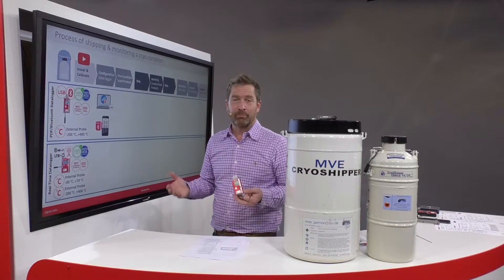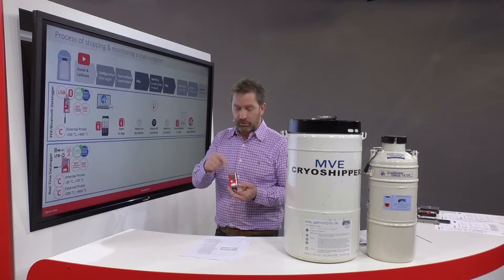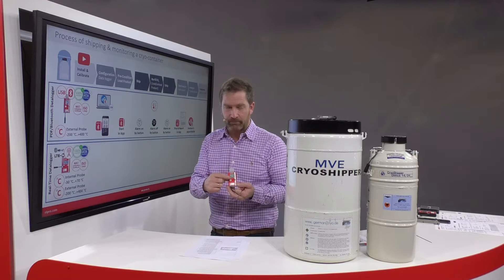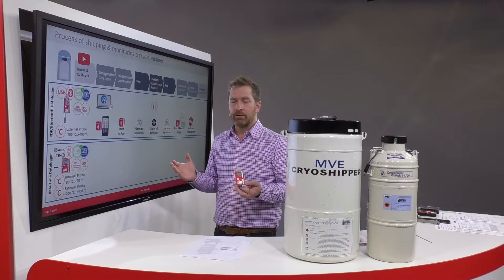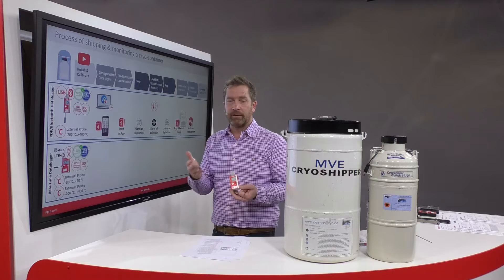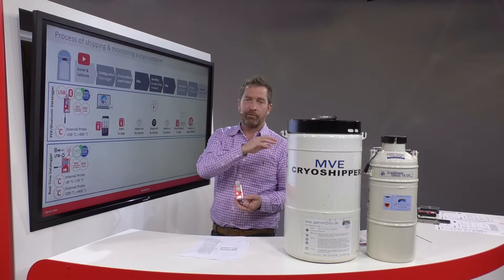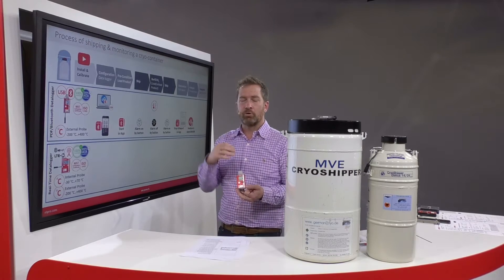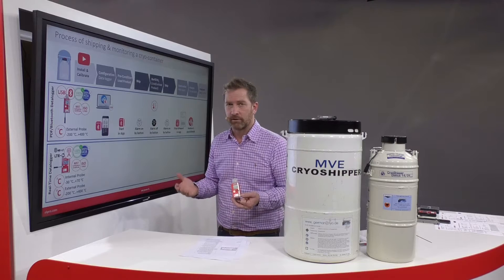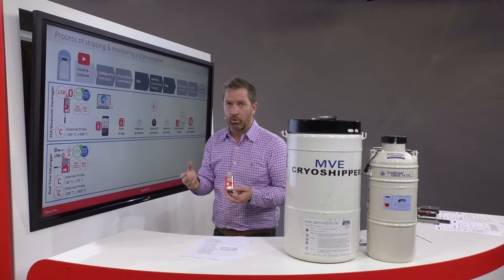We are now ready for the preconditioning of the container. First you start the data logger either in the smartphone app or on the data logger by pressing the button. Now we are documenting the cooldown phase after filling with liquid nitrogen. The lid is taken off, the product is inserted, the lid goes on, and now we are ready to start alarming by pressing the alarm on button.